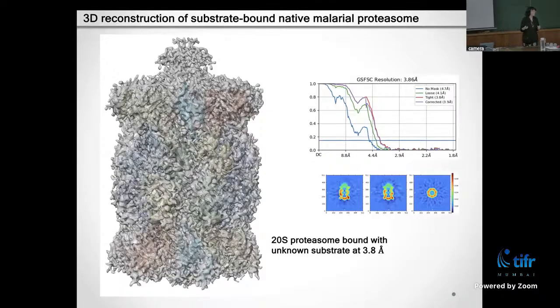So is the relative concentration the guide to say, okay, this is a valid member of my grid? Or is it just an anomalous presence? No. So in fact, in the first data sets, we got things which were probably present in larger quantities. The structures that we solved of the proteasome and some other complexes that I'll show were present in relatively larger amounts because they are being secreted.